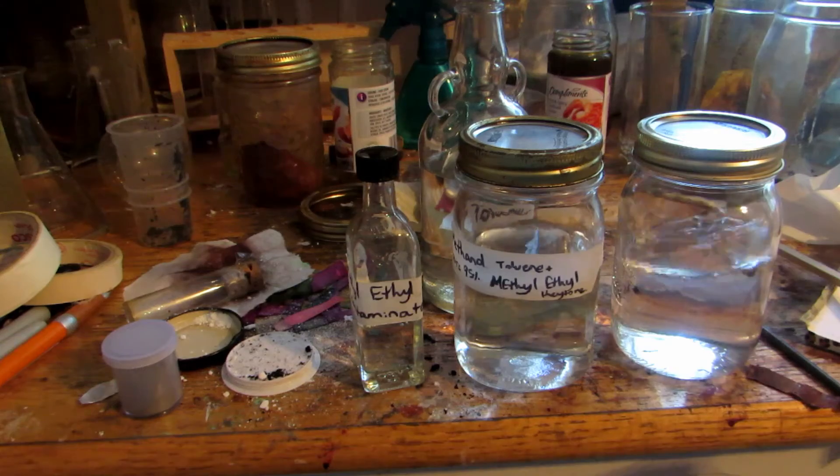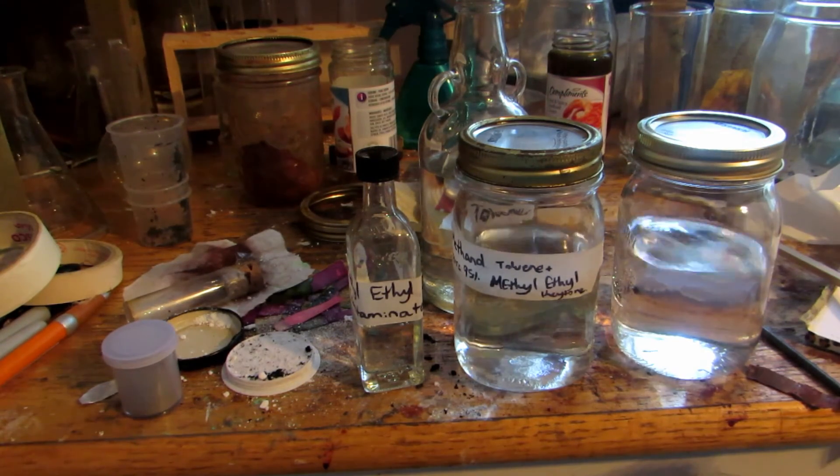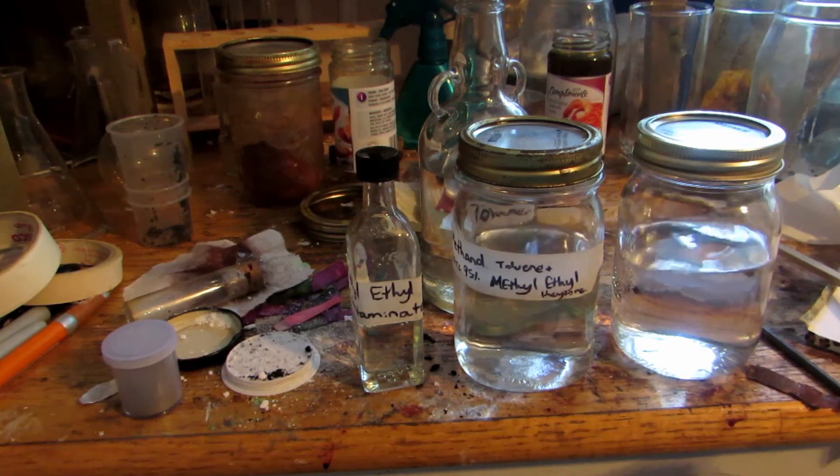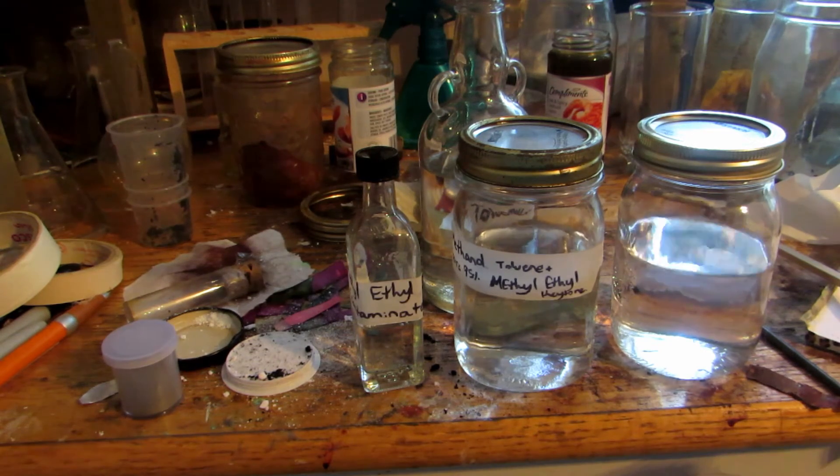What I'd like to do is take these two contaminated jars, throw them back into my distillation apparatus, and put them through again — this time with a fractionating column. That way I should be able to separate out the methanol from the methylethylketone and be left with some residual toluene if there is any. And that's basically how to remove toluene and methanol from lacquer thinner.